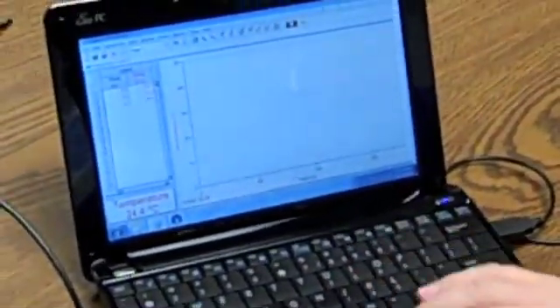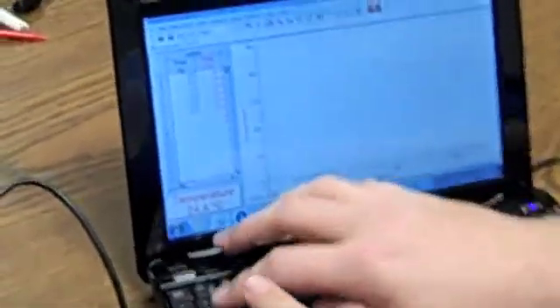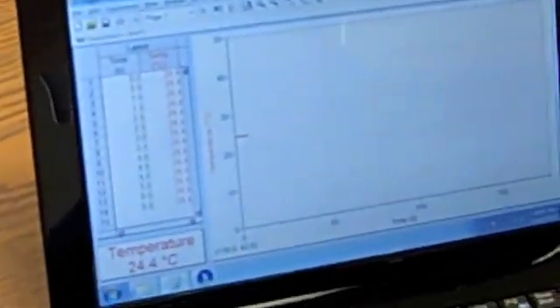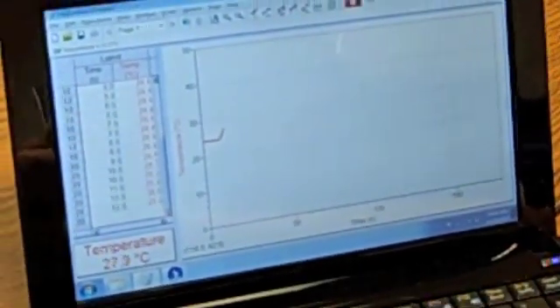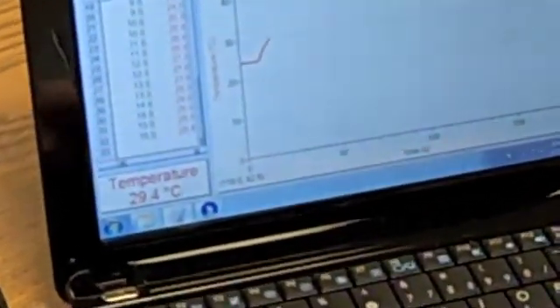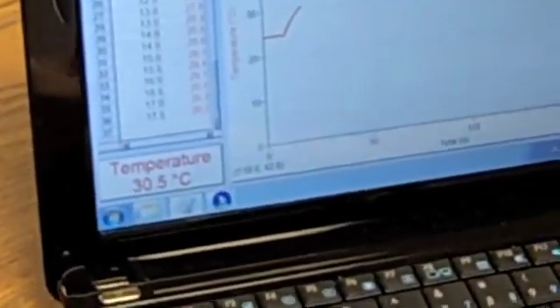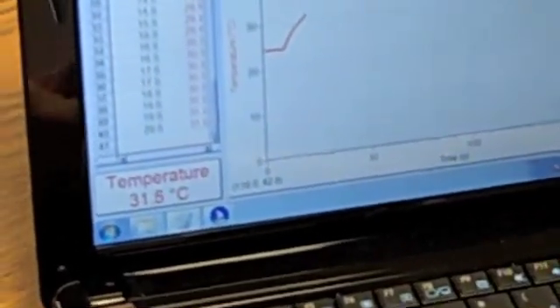Space, collection and progress. Automatic announcement, enter. Automatic announcement of sensor one activated. 24.4, no object selected. 24.4, 24.7, 26.9, 28.3, 29.4, 30.7, 31.6.